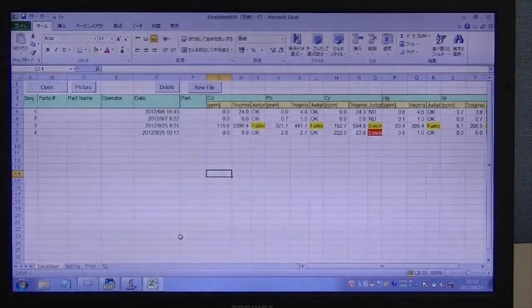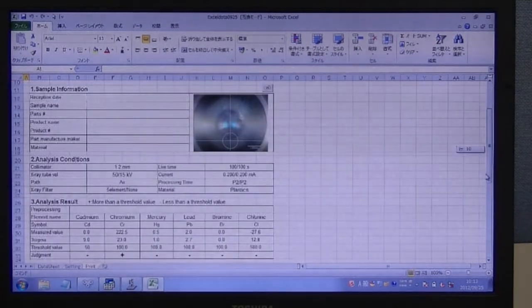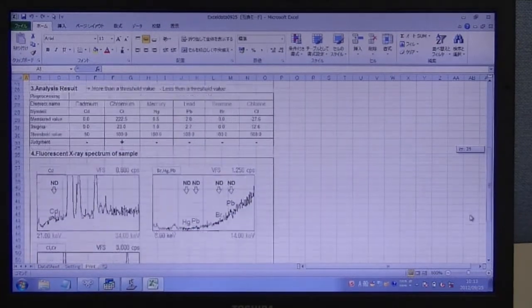You can transfer the result into an Excel file and evaluate the data. The printout will include images as well as the numerical data.